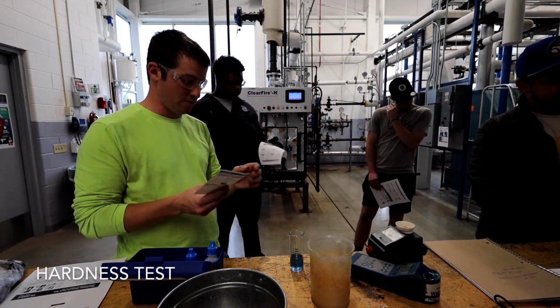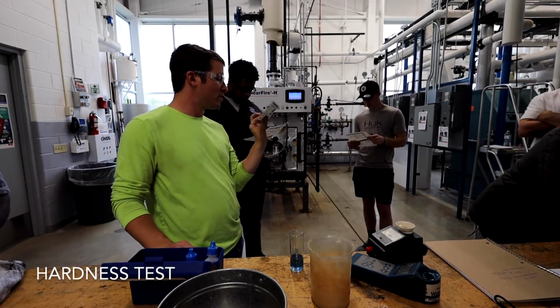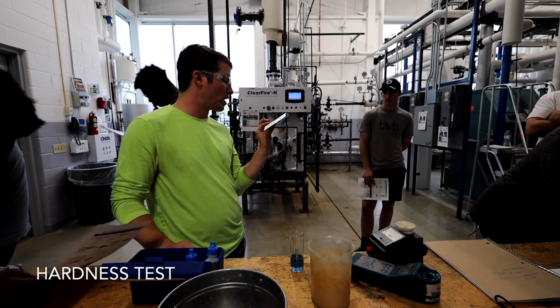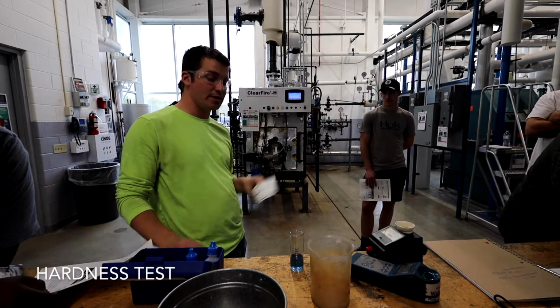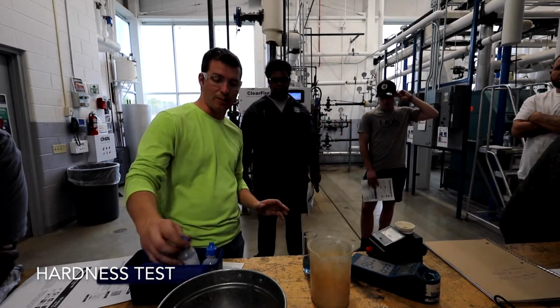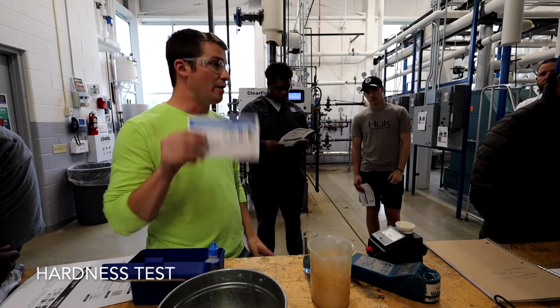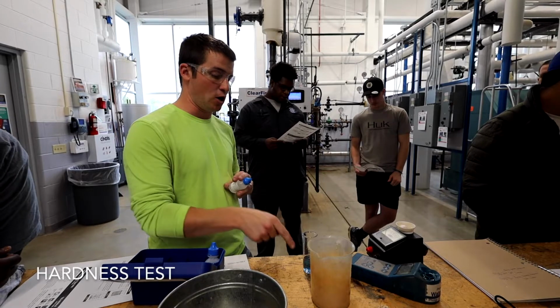So on the back of this card, there's a little tip. Interferences. Metals may cause difficulty in seeing the endpoint. If metal interference is presumed, add 1 drop of the titrant to the sample before adding buffer or indicator, and then include that in your end calculation. That will help get a better color change. So if we had hardness or something interfering, I would take my titrant, which was the final step, right, step 4. I would add 1 drop in before I do step 2. And what that's gonna do is it's gonna tie up any potential metals that are in the water. That will actually help you get a better color change.